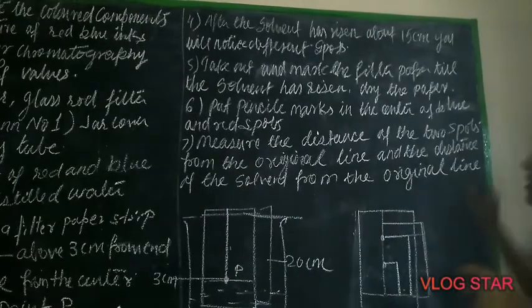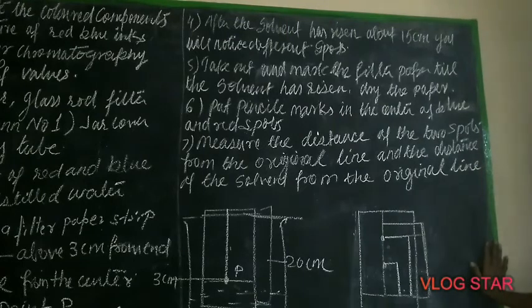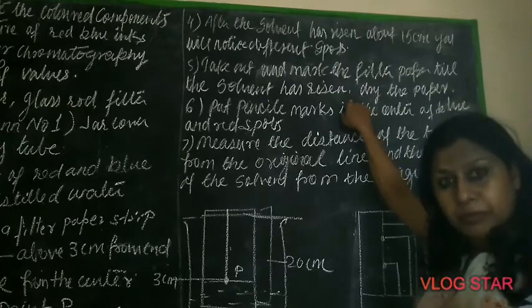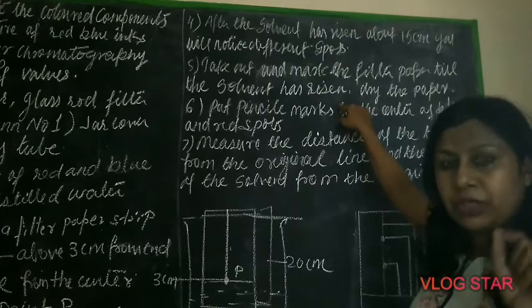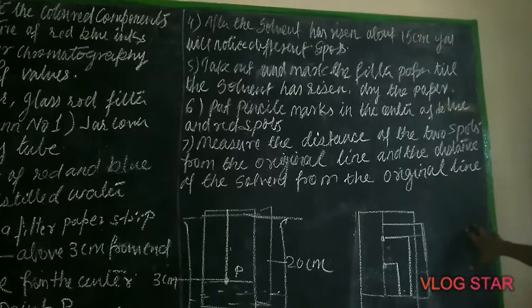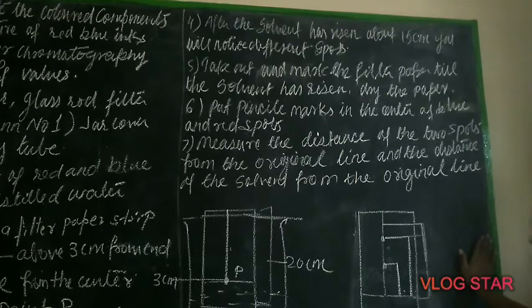Once the solvent has risen to 15 cm, you will find different spots. Take out the filter paper and mark where the solvent has risen — from the point of drop till where the solvent has risen. Mark it before the solvent dries, because after drying you'll only see spots. Then put pencil marks in the center of the blue and red spots.